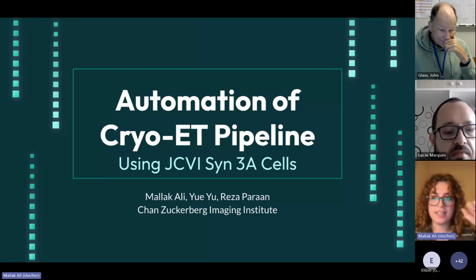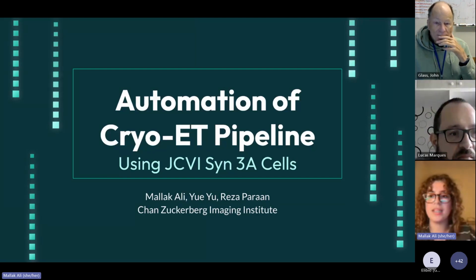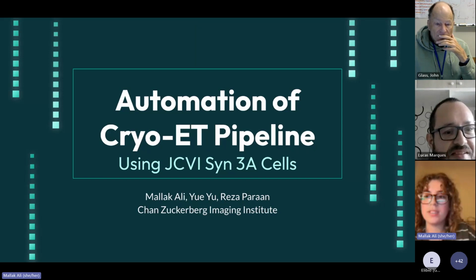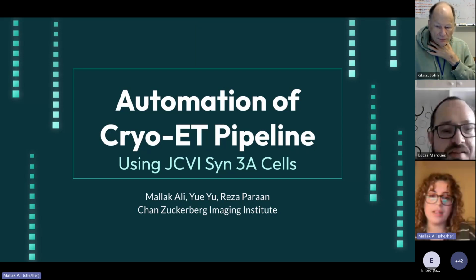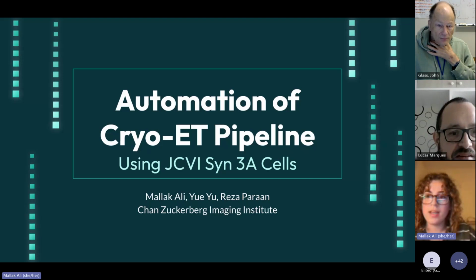I'm a research associate at Chan Zuckerberg Imaging Institute, and today I'll be presenting about how we've used specifically the JCVI-syn3A cell line to assist in automating the cryo-electron tomography pipeline.